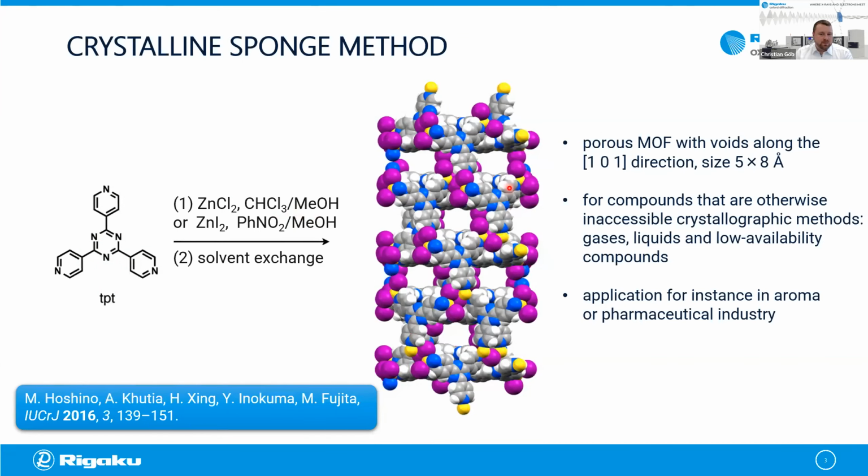The pores of this material, they will be occupied with the solvents from the synthesis. These typically bind very strongly. To make room for your analyte molecule, you have to exchange those to an inert solvent. Typically, hexanes are used, N-hexane or cyclohexane. Could also be longer if you want to have slow evaporation of the solvent, or it can also be smaller, like a pentane, if you want to increase mobility of it.